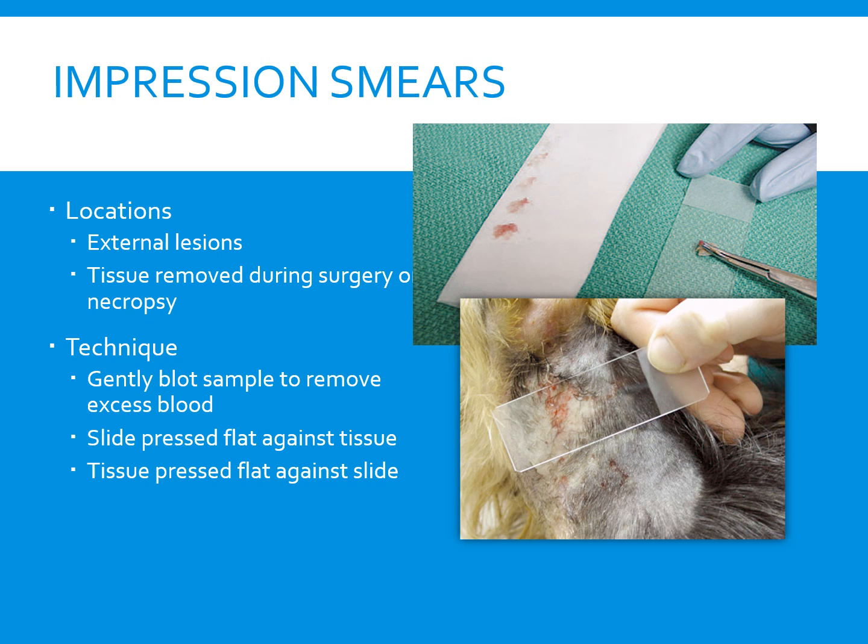As a result, these imprints from lesions often reflect local secondary bacterial infections or inflammations, and they may hinder the accurate diagnosis of cancer. To collect imprints from tissues that we've taken from surgery or necropsy, the blood and tissue fluid should first be removed from the surface of the lesion being imprinted by blotting with a clean absorbent material, as excessive blood and tissue fluids inhibit tissue cells from adhering to the glass slide, thereby producing a poorly cellular preparation.